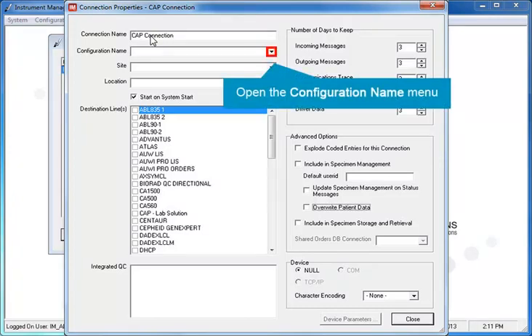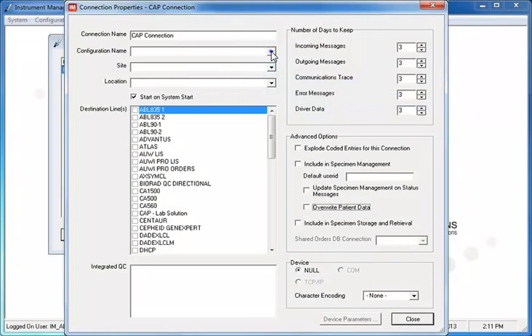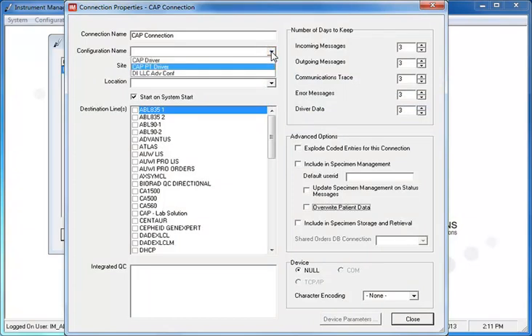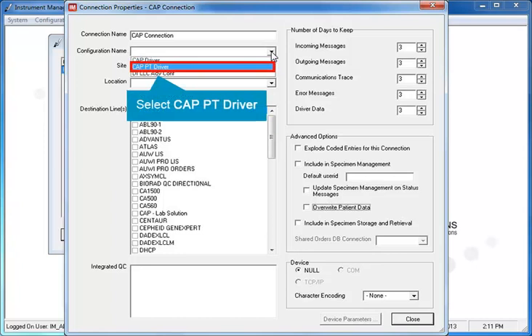Open the Configuration Name menu and select the configuration you created using the Configuration Editor, CAP PT Driver.